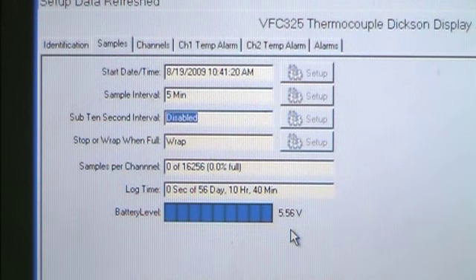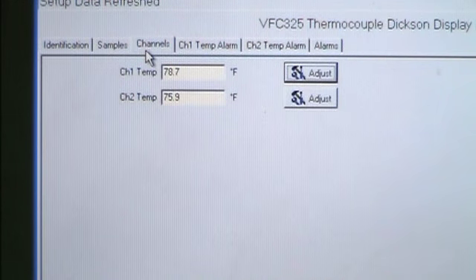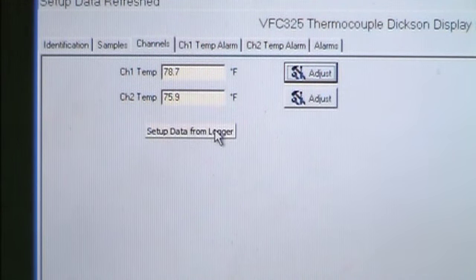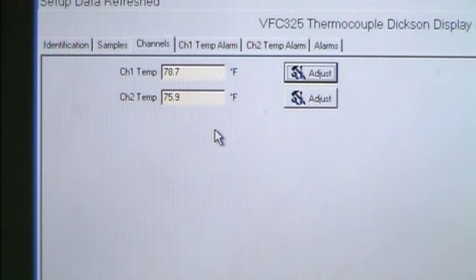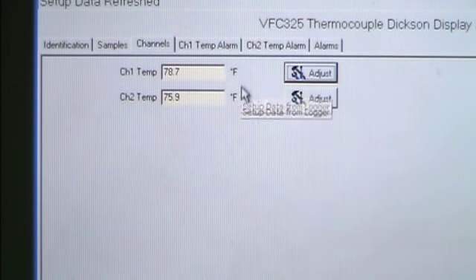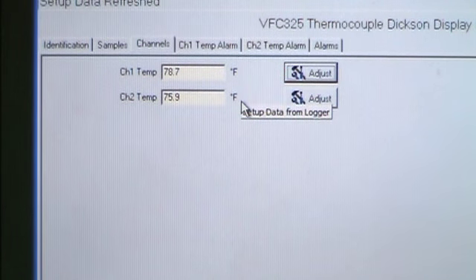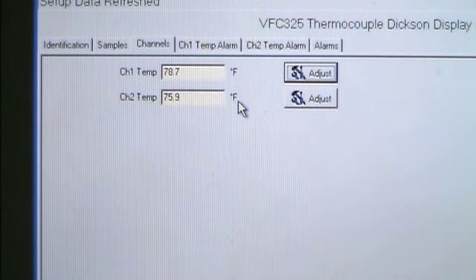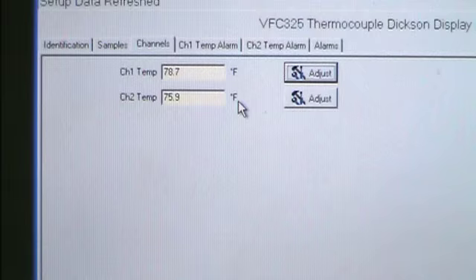Choose the Channels tab. Each vaccine data logger has two channels. For the VFC325, Channel 1 is the Freezer Temperature and Channel 2 is the Refrigerator Temperature. For the VFC320, Channel 1 is the External Probe and Channel 2 is the Ambient Temperature where the logger is placed.